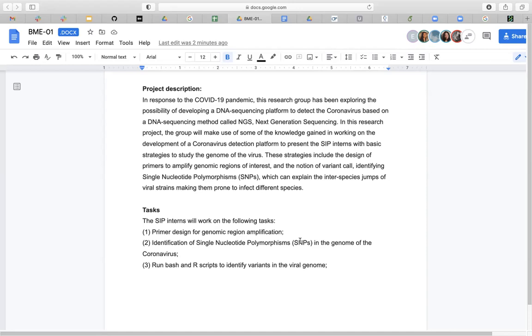The three groups are going to take advantage of that, because BME 4 can use the command grep, for instance, to identify mutations present in the VCF files that are produced in the bash pipeline.